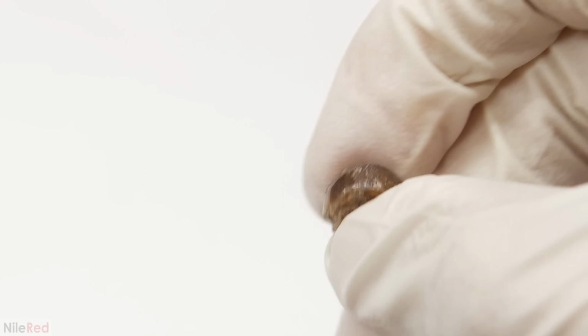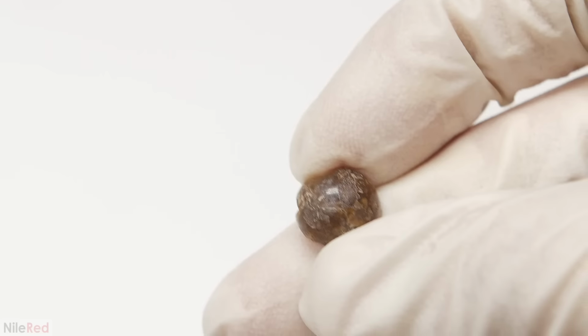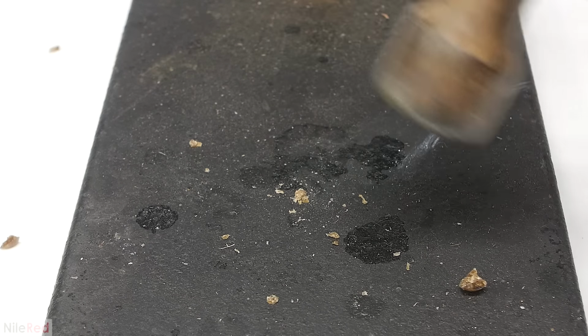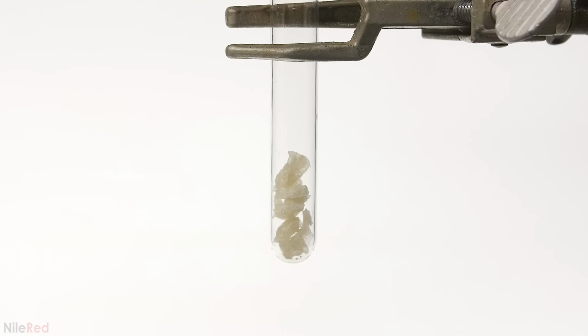Although it turned brown, probably because I heated things up a bit too much, I was still pretty impressed with it. I was curious to see how durable it was, so I got my hammer. Unfortunately, with just a couple small taps, it crumbled into pieces. Its lack of strength, I imagine, mostly comes from the terrible heating method and the presence of a lot of triacetate. As another test, I thought that maybe the brittleness could be helped by adding some more plasticizer.